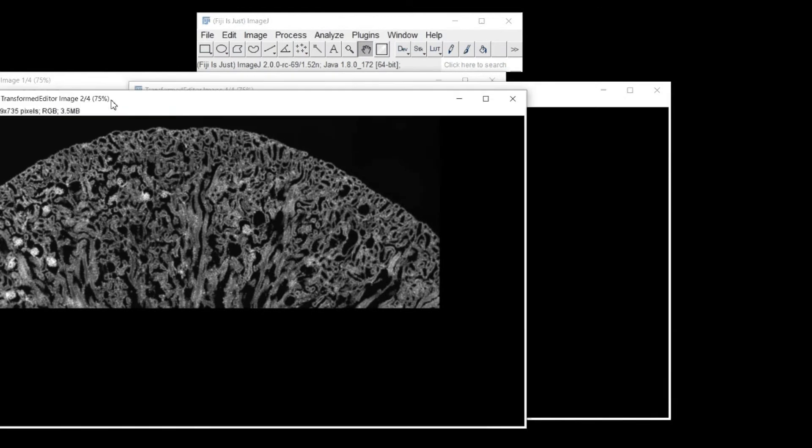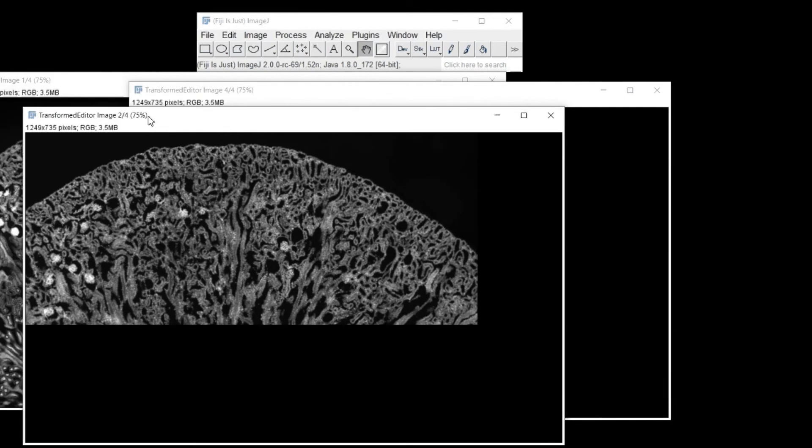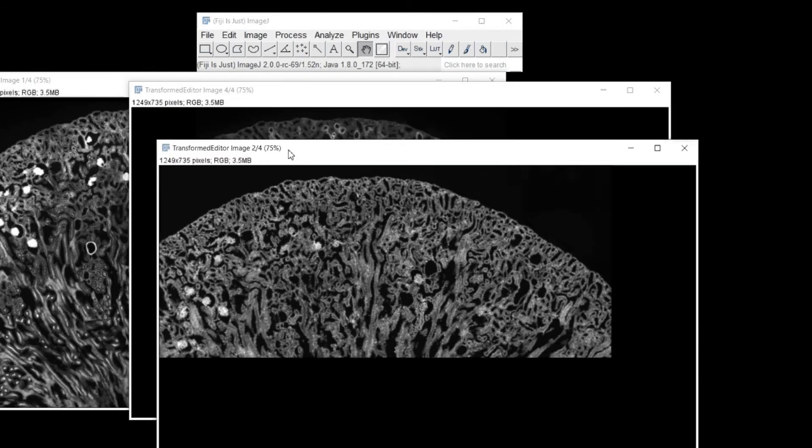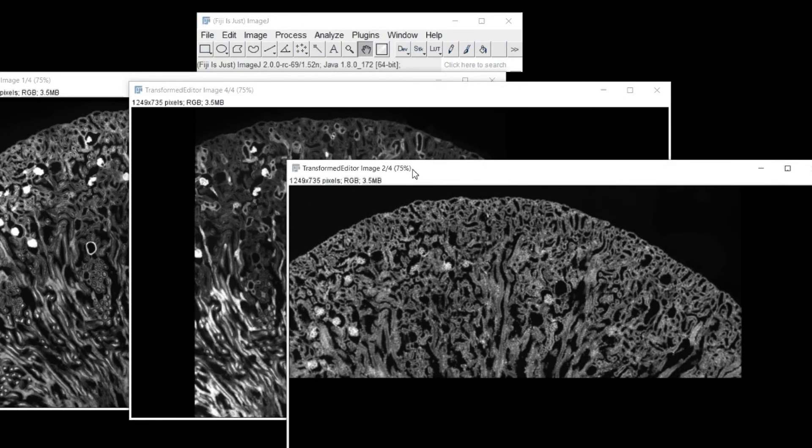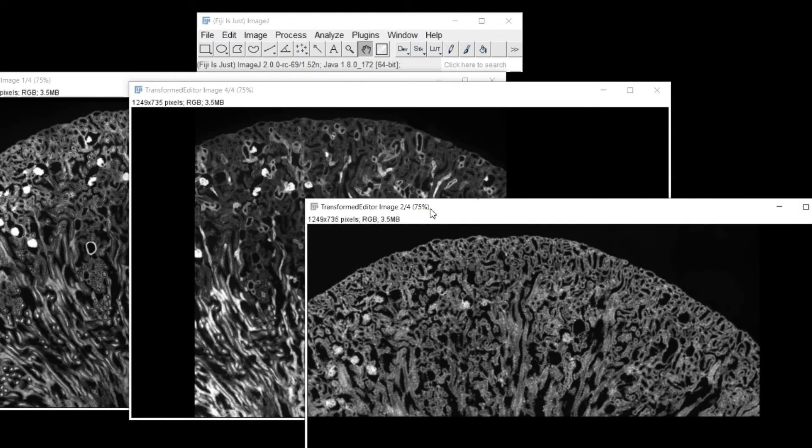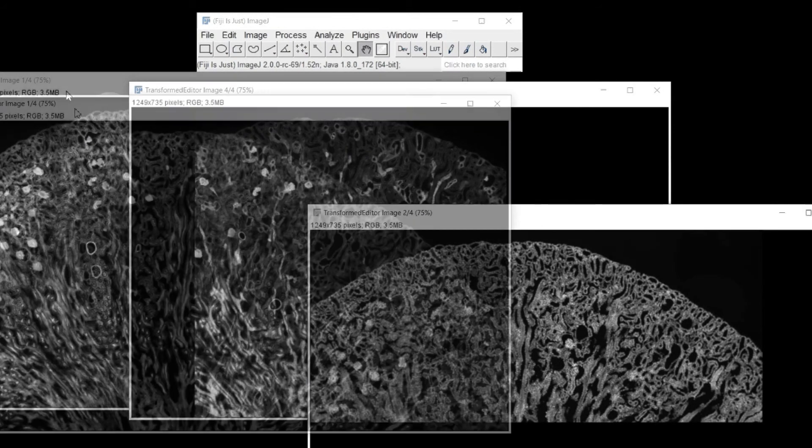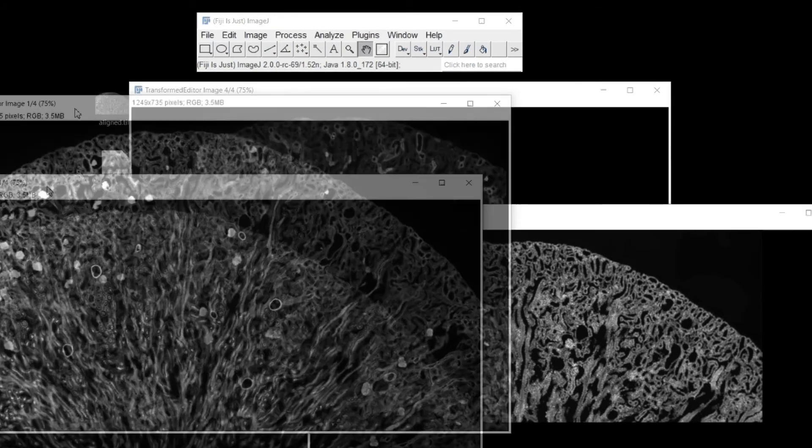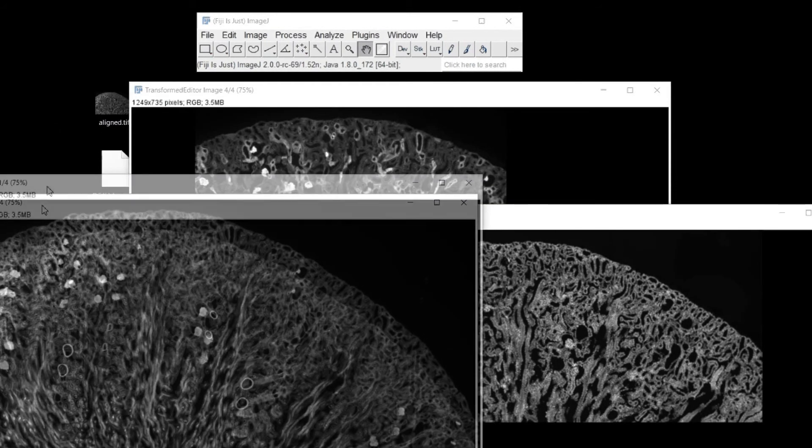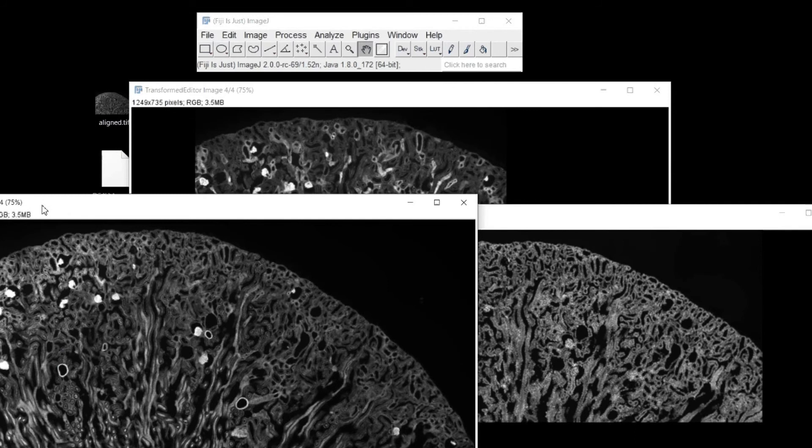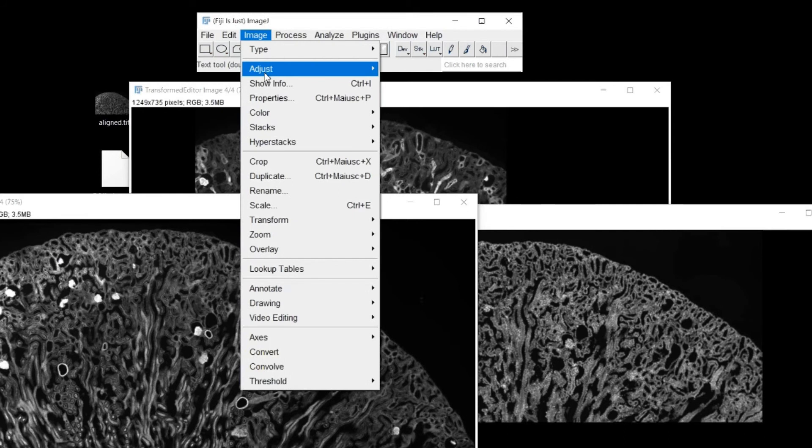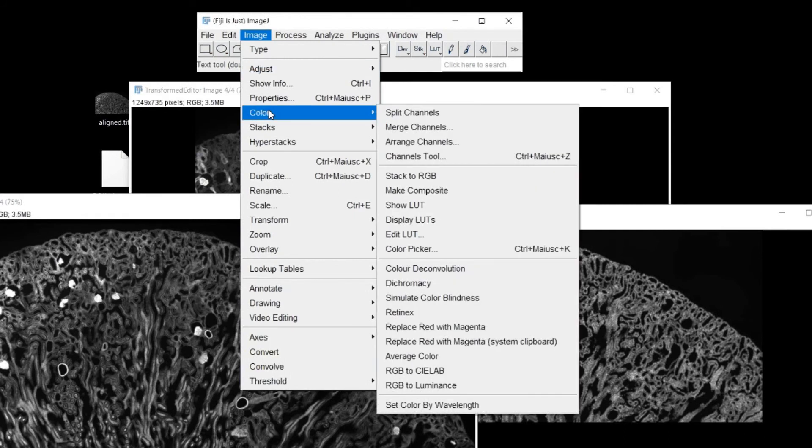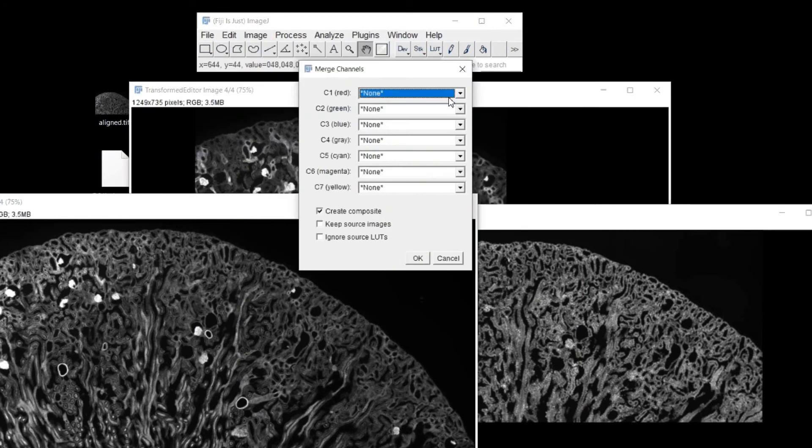First, I split the stack in the composing channels using the Image, Stack, Stack to Images function. Then I decided which channel to assign to the red color, which one to the green one, and which channel to the blue one, using the Image, Color, Merge Channels function.